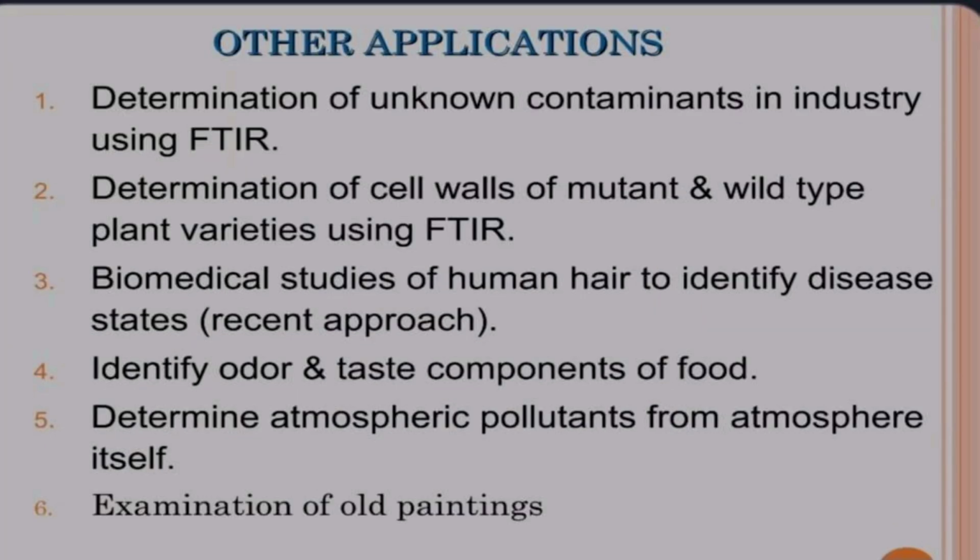Other applications include determination of unknown contaminants in industry using FTIR, determination of cell walls of mutant and wild type plant varieties using FTIR, biomedical studies of human hair to identify disease state, identifying odor and taste components of food, determining atmospheric pollutants from the atmosphere itself, and lastly the examination of old paintings.